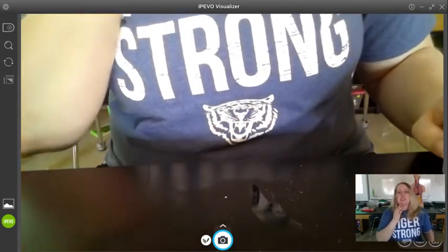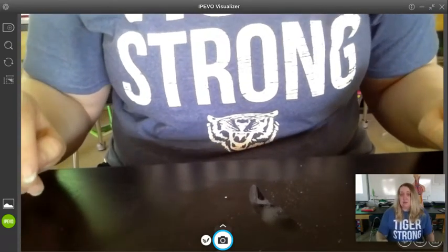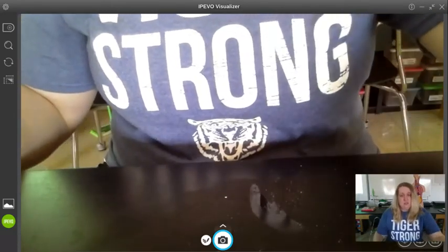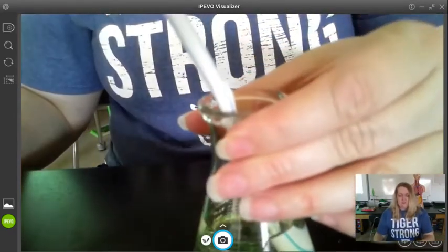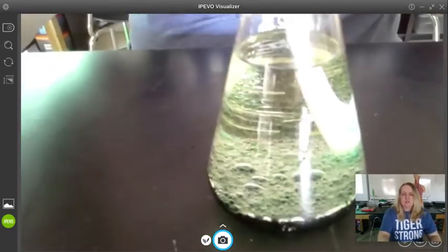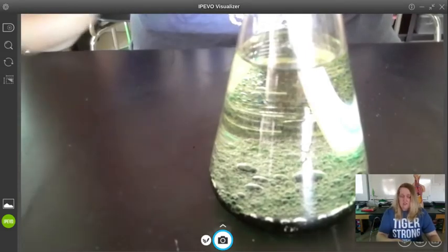Now, I'm going to take a minute. I want to mix in experiment 3 and experiment 4 just for an intermediate little activity. In front of me, I have an Erlenmeyer flask that has oil and water in it.